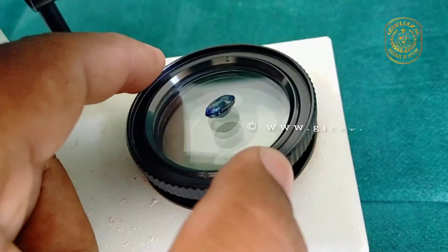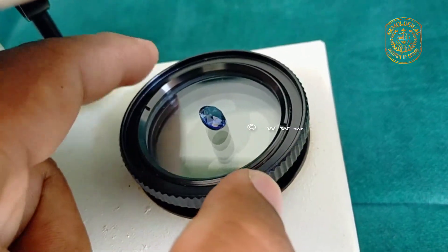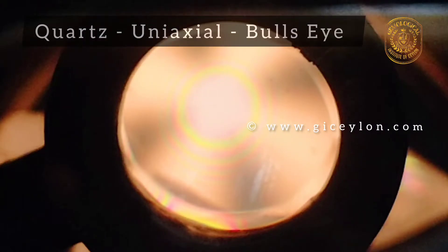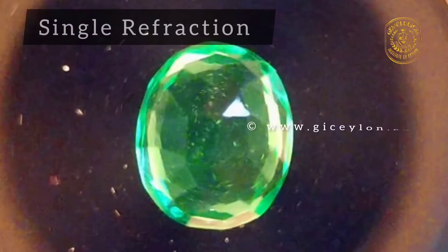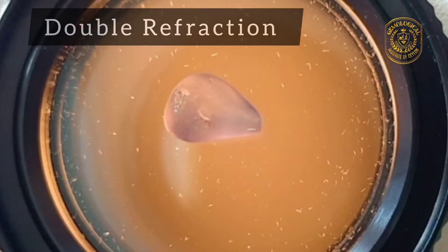From the observations, the following information can be derived: optical character, isotropic or anisotropic nature, microcrystalline or polycrystalline nature, double refractive aggregate strains, and anomalous double refraction.